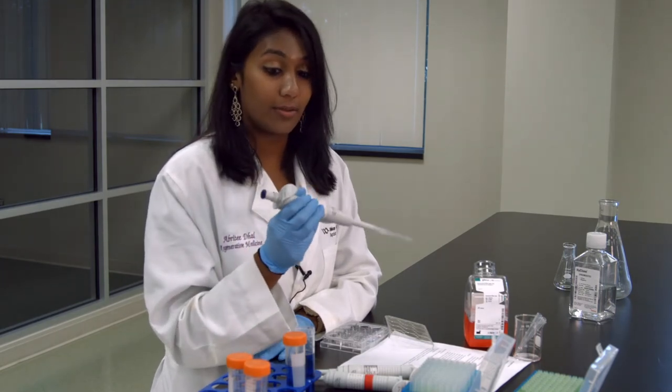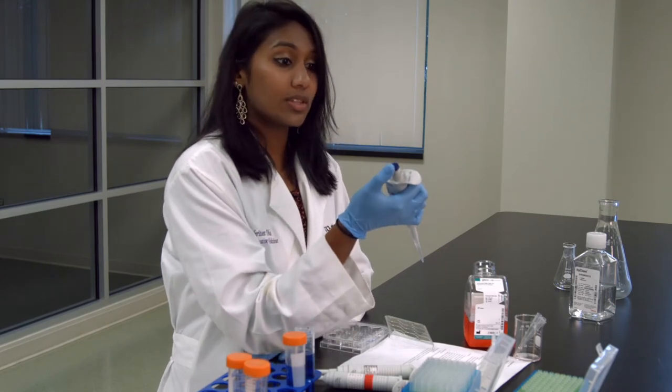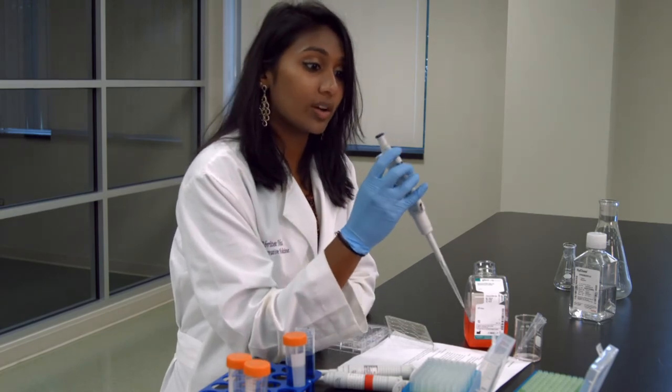Unless you're using the same media or the same solution, you never really want to reuse a micropipette tip. So there's a way to get rid of the micropipette tip. We've been using this top button to get the liquid out. For ejecting the tip, we use this one right here.